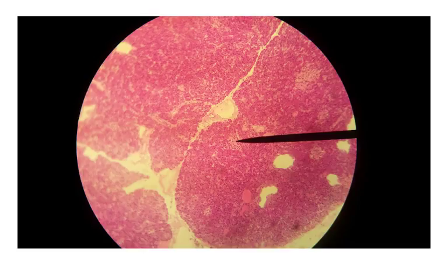And on this slide, they could ask you, what organ is it? They could ask you, is it endocrine or exocrine? Remember, it's both. They could ask you any of the structures that we've just covered, aceni cells, pancreatic duct, islet of Langerhans. And they could ask you what is made at each region. Aceni cells make those digestive enzymes. Islets of Langerhans make insulin and glucagon. They could also ask you, for the islet of Langerhans, what is a disorder associated with either hypo or hyper secretion of the hormones.